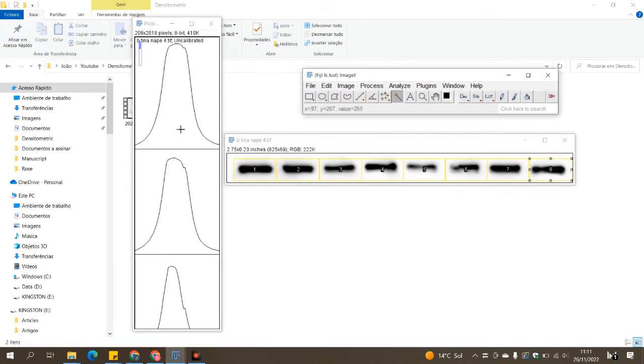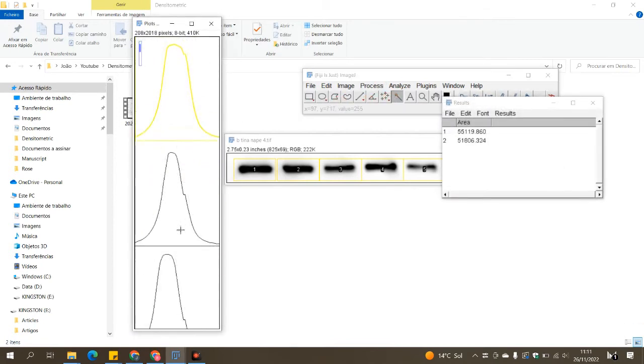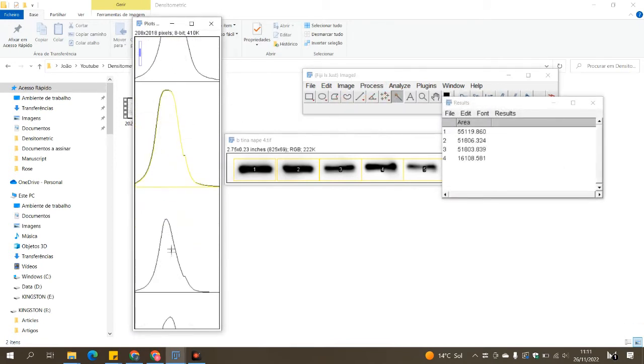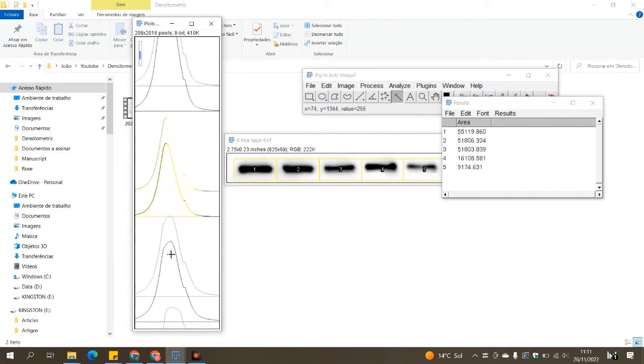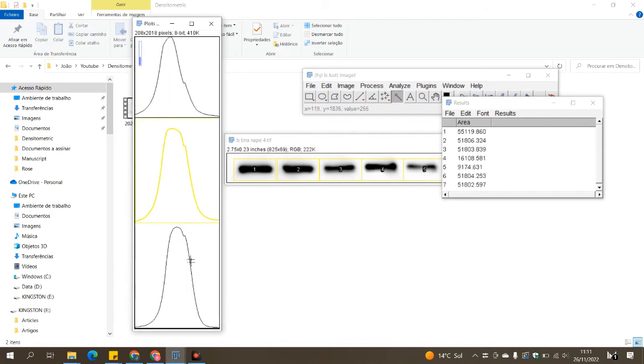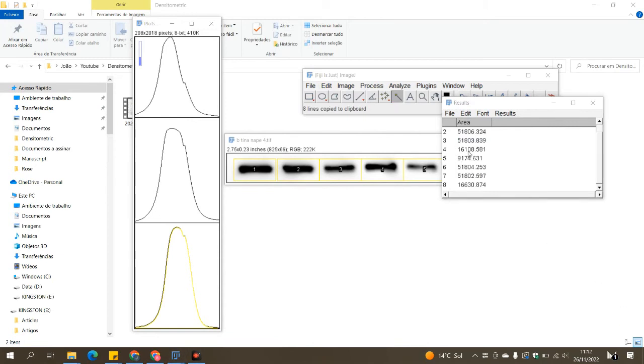If they are perfectly formed like these ones in the image, you just click on the magic wand tool and select all of them, and you see that the values of the areas start to show up in the results. After that, you just copy and paste them in the Excel file.